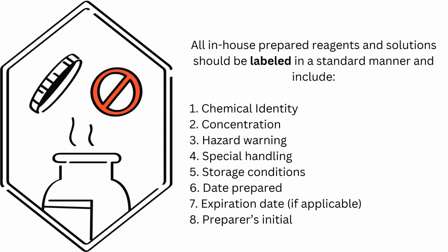All in-house prepared reagents and solutions should be labeled in a standard manner and include the chemical identity, concentration, hazard warning, special handling, storage conditions, the date when that solution is prepared, the expiration date if it's applicable, and also the preparer's name or the preparer's initials.